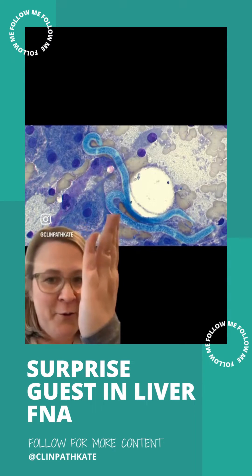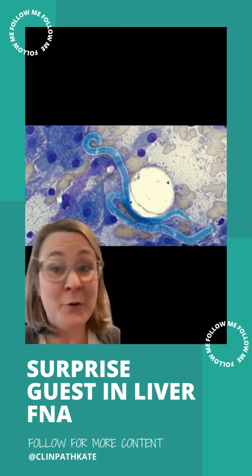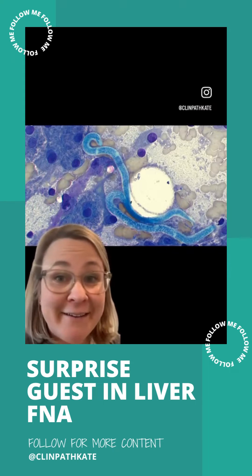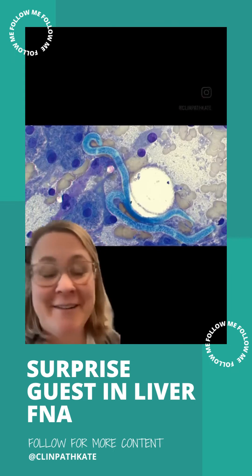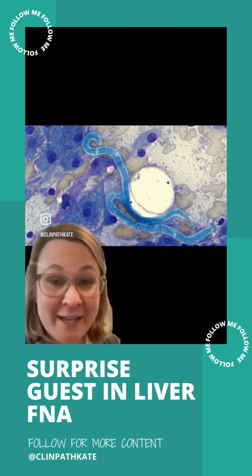However — what are you guys doing in there? That's not normal in a liver. And what are those? Those are microfilaria. Why are you here? This is what the vet or the tech is usually asking themselves when they're looking at the cytology.